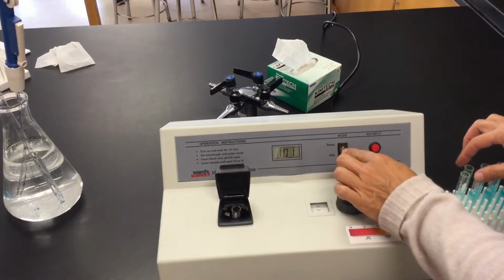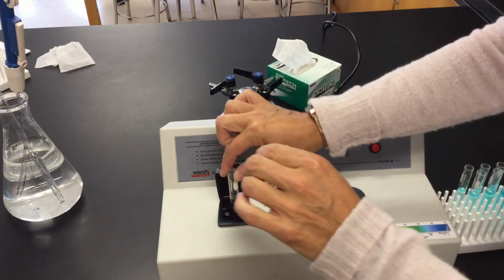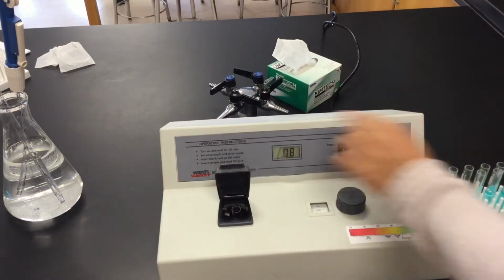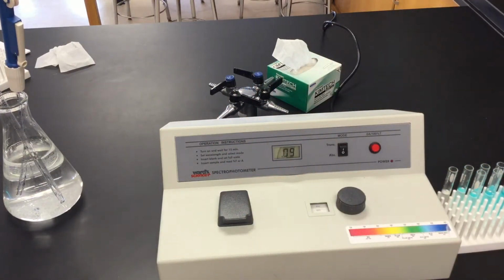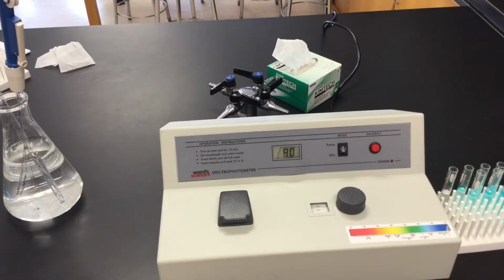I'm going to switch my toggle switch back to absorption. I'm going in and putting in tube number 2. I do not have to re-zero. I'm at my maximum wavelength now. So now my absorption is going to be 0.09. My transmittance, 80. Okay, so now we're at 80% that's actually being transmitted through.